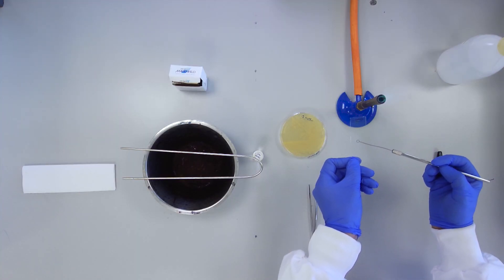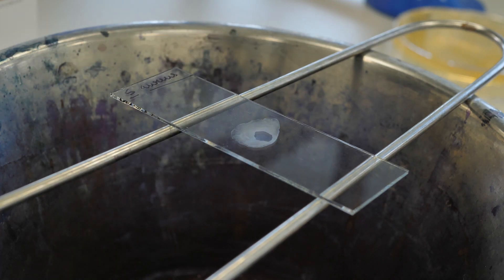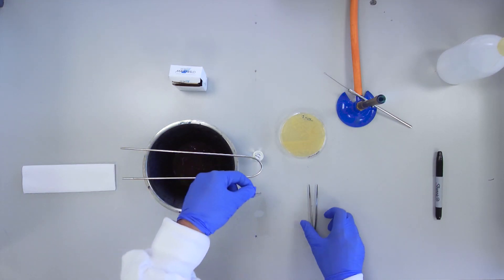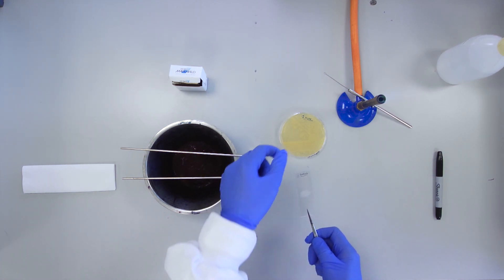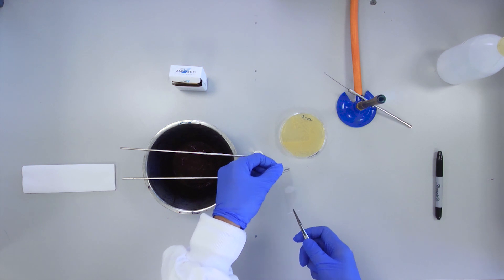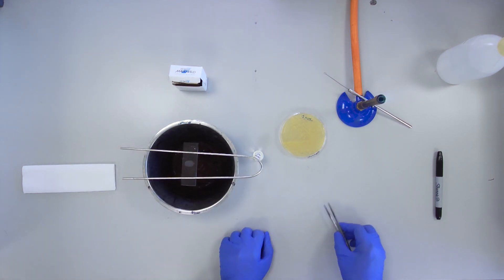Set down the slide and allow the smear to air dry. Once completely dry, heat fix the smear by carefully passing the slide, smear facing upwards, through the Bunsen flame three times. Do not overheat the slide or hold the slide in the flame.